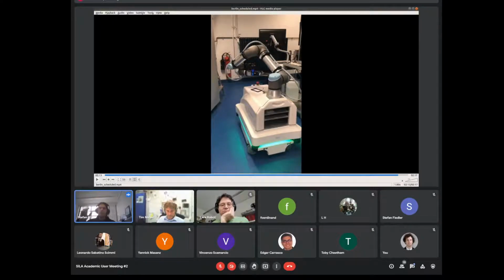And you give him a tablet, which is running a SiLA server. Then you can send these movement commands to the tablet. So the human gets a message, okay, please transfer the plate from here to there on that position now. Then the human does the job, says, okay, I'm done, which will send on the SiLA way a command finished signal, and the process goes on.